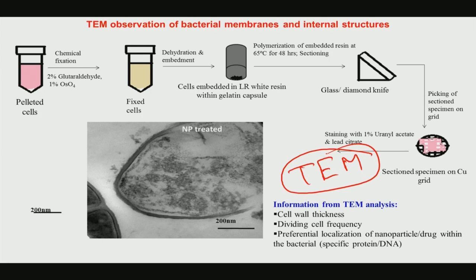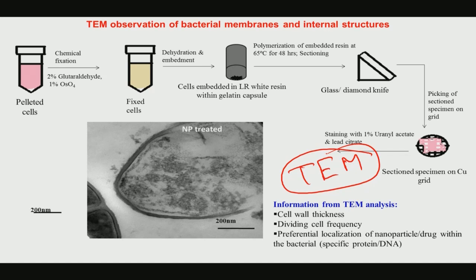The first hurdle in using transmission electron microscope for cells and bacteria is to appropriately prepare the sample. The sample preparation is the most difficult stage in TEM investigation, particularly for biological samples like cells or tissue sections. So, there is a technique called ultramicrotome. So, this ultramicrotome, if you do this, there you can essentially make very thin sections.